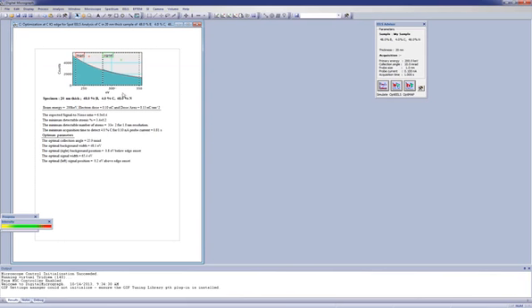So it basically suggests a large background and signal window. You get as much signal as possible inside the quantification window, and a large background window so that you can generate a good fit in the vicinity of the edge.